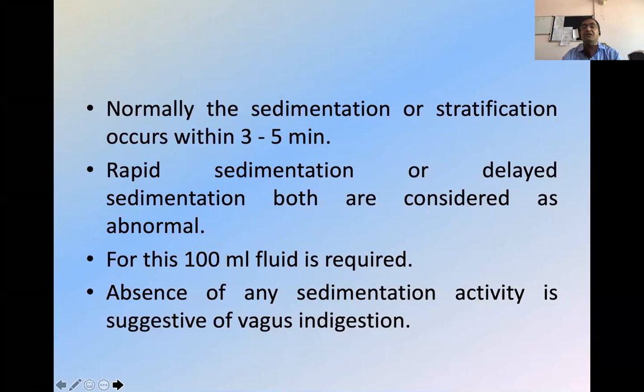So in this practical, we will collect the fluid, allow it to settle, maintain the anaerobic condition, and note the time interval. We will do this practical when you come here. For this, around 100 ml of fluid is required.